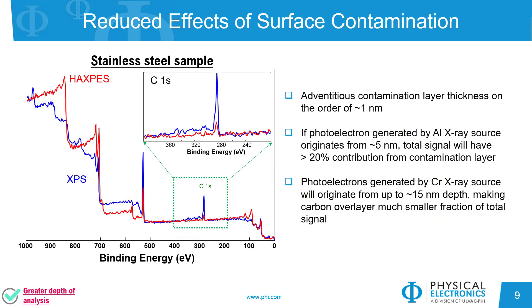A common feature in XPS spectra for samples handled in air are adventitious carbon and oxygen. As shown on this steel sample, they can make up a significant portion of the analysis volume and attenuate your peaks of interest. With the increased depth of analysis in HAXPES, surface contamination makes up a smaller fraction of the detected signal and reduces the need for surface cleaning that could potentially damage the surface.